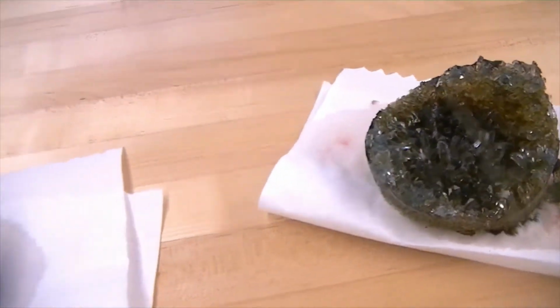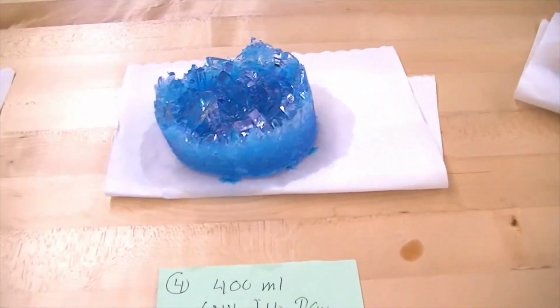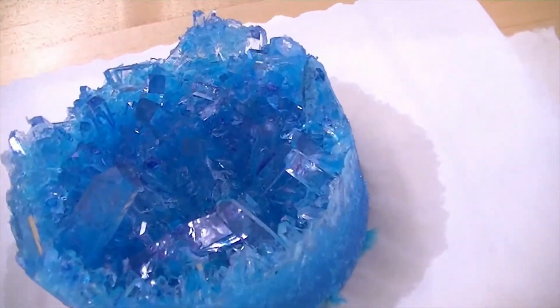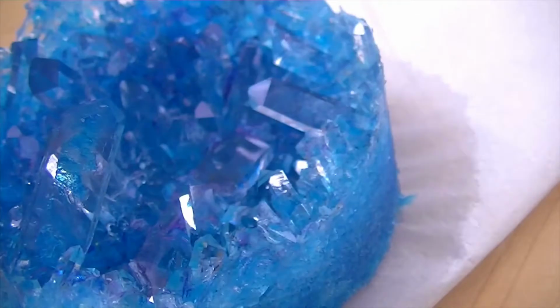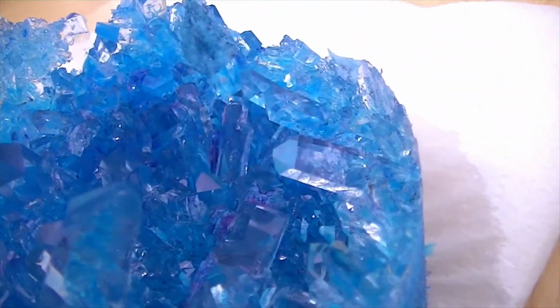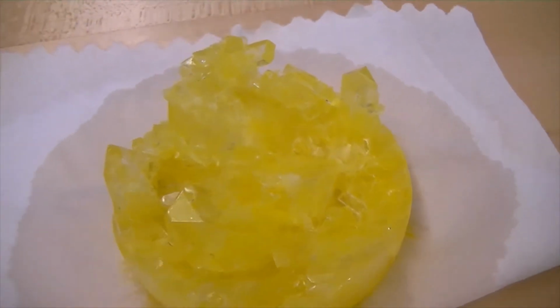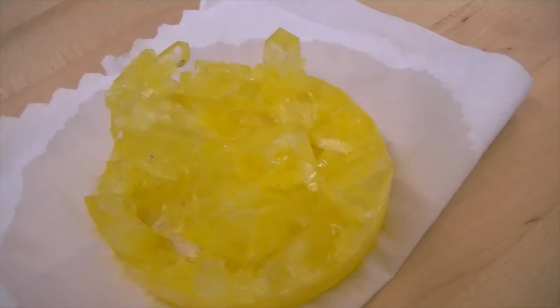And the same could be said for number 4, which has 400 milliliters of ammonium phosphate. And the number 3 with 350 milliliters, not as many crystals, but these crystals grew pretty large.